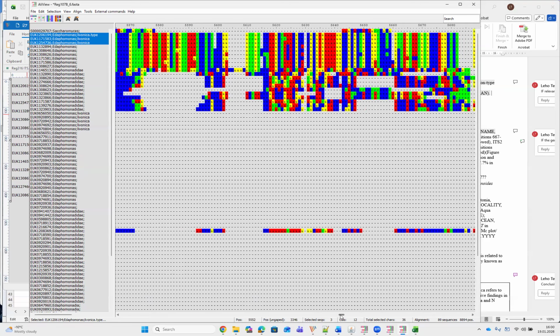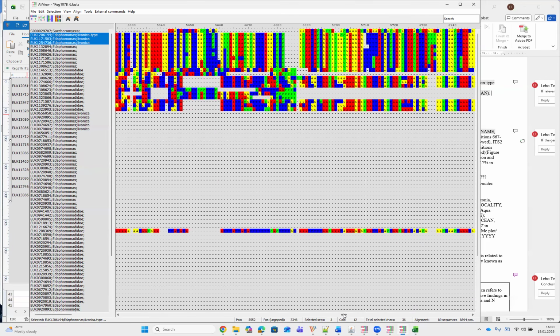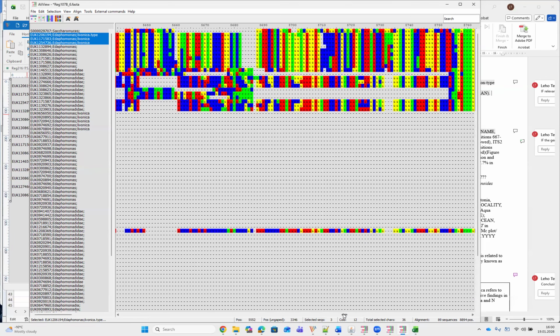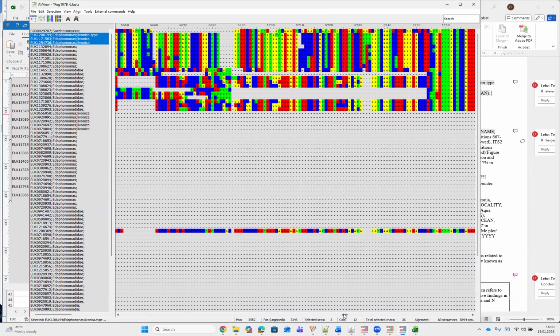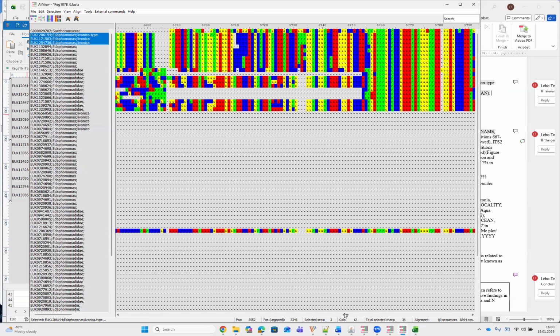Let's go further. And what I recommend is to try to select this specific barcode in the first 1,000 sequences of large subunit because it's the most broadly used and most variable of this region.